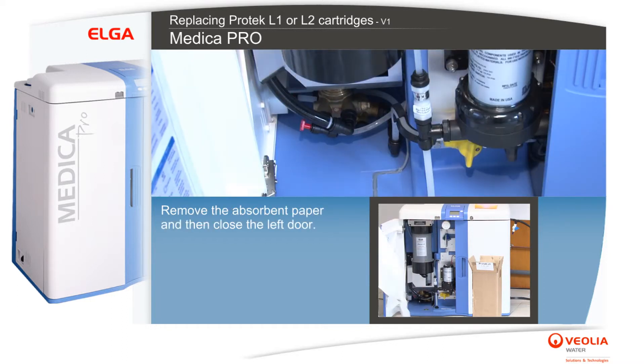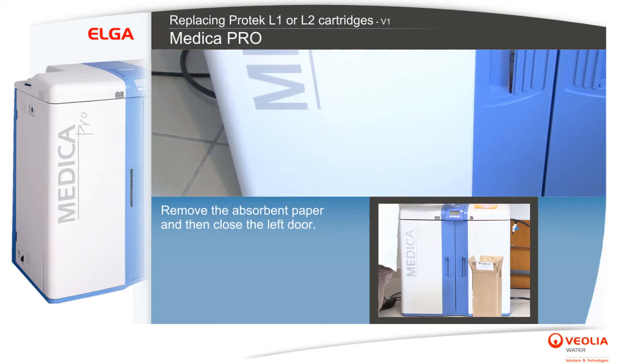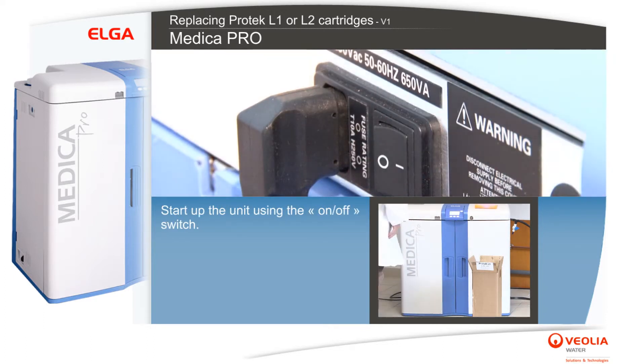Remove the absorbent paper and then close the left door. Start up the unit using the on-off switch.